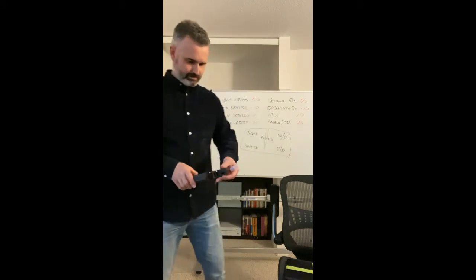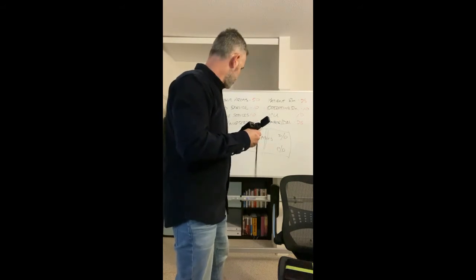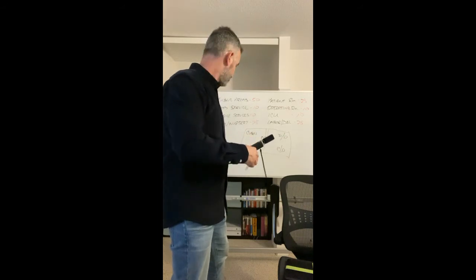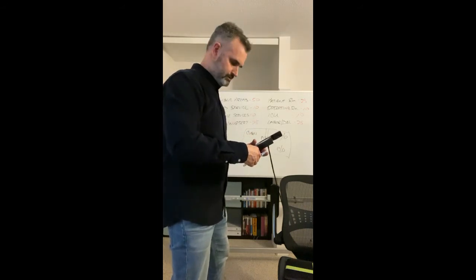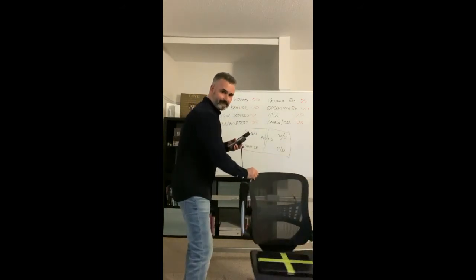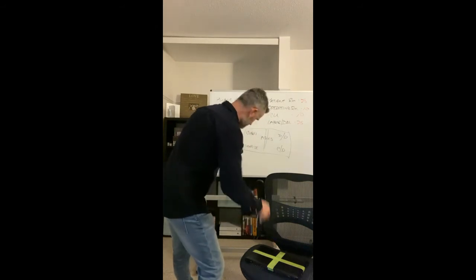Okay, all right, now the good stuff begins. So we hop in here. We will do our clean only first. So I'll pull this over. Okay, there we go. So clean only, and we got the aces there.